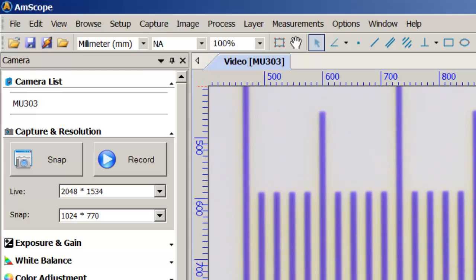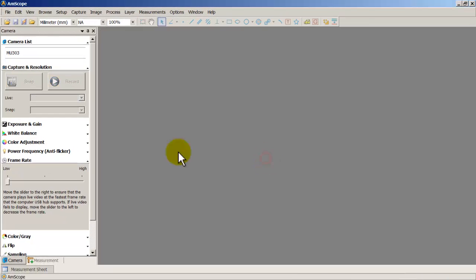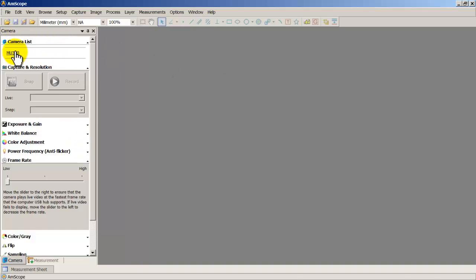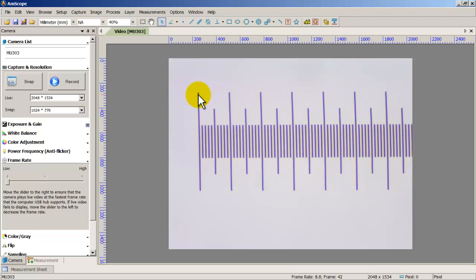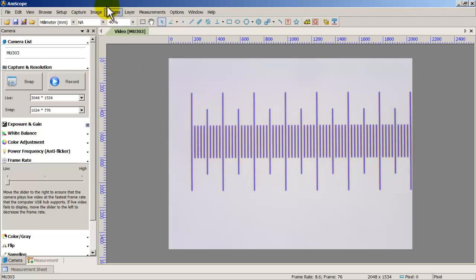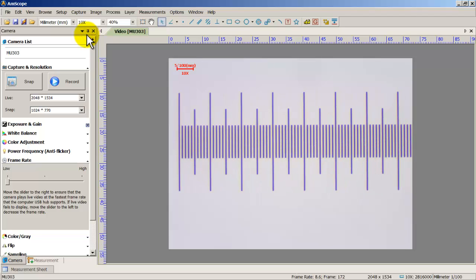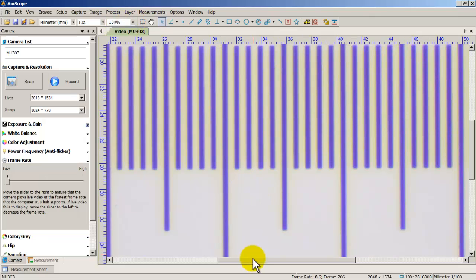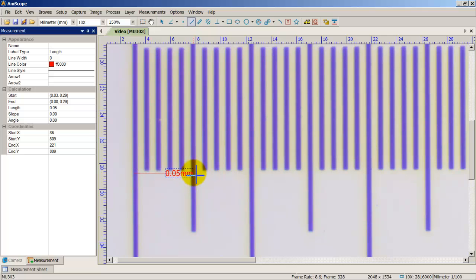Let's verify the 10x calibration is correct. I'll close out without saving the measurement layer and reopen the camera. There's the micrometer stage. Change the objective dropdown from NA to 10x, set zoom to 150%, choose the line tool, and measure from one point to another — and there you go: 0.05. Perfect calibration with no mistakes.